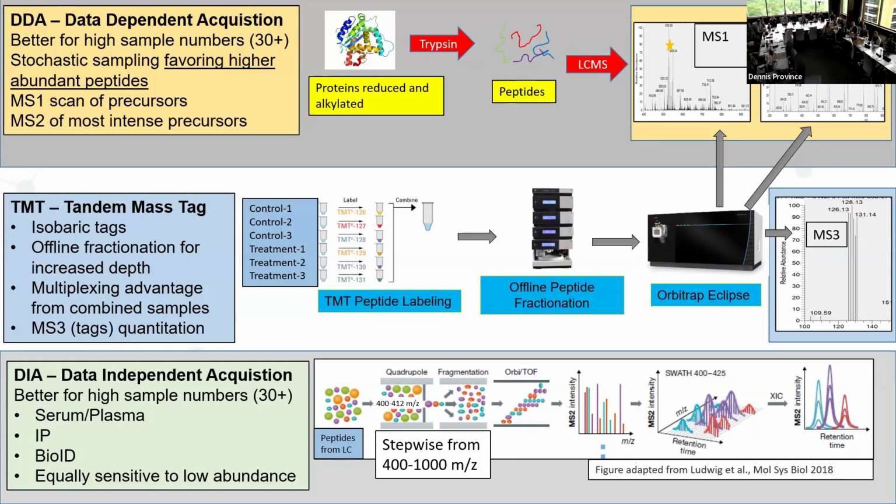And so we are able to put time back in there, whereas an MS2 up here in the DDA is a very static snapshot where we say, well, that's from one ion, and we can figure out what the spectra is, the fingerprint for that peptide. Here, we would say, well, this is one fragment, that's one fragment, that's one fragment, all of the same peptide. And so once I know the m/z of those fragments, I can figure out what my peptide identity is.